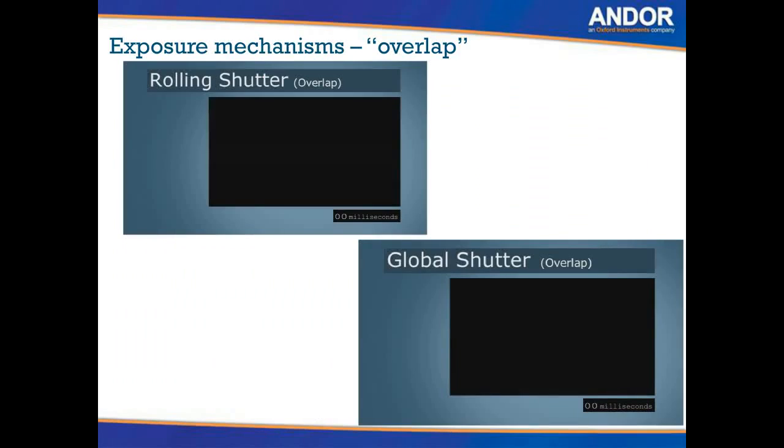So the next slide then has two movies, and if you play the movies, we have a rolling shutter and a global shutter movie.